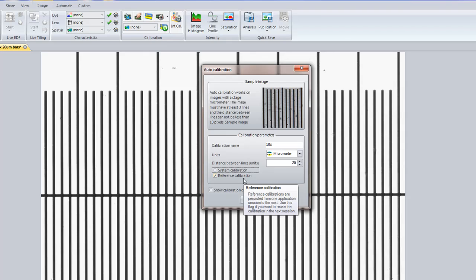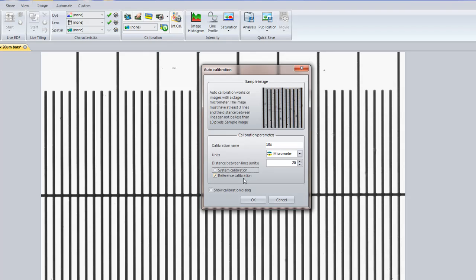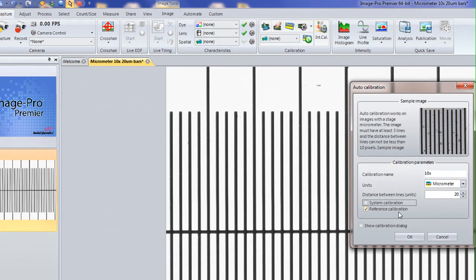This reference list of calibrations can be later used to link to a camera and an objective, so you always apply the correct spatial calibration when the image is acquired. That will be shown in a separate video. Right now, I'm going to create my reference calibration. I'm going to press the OK button.